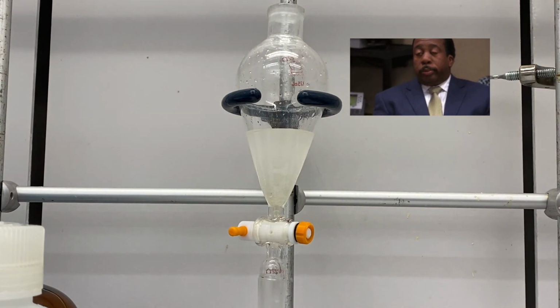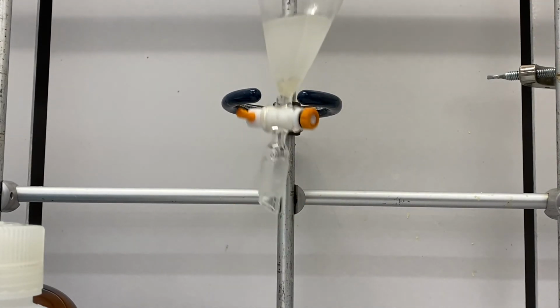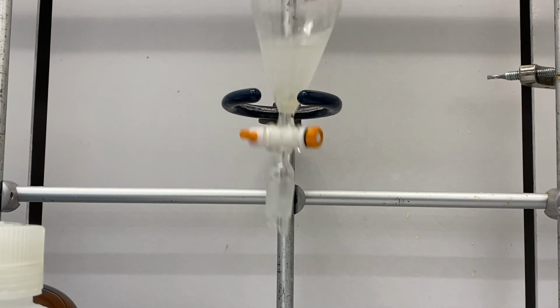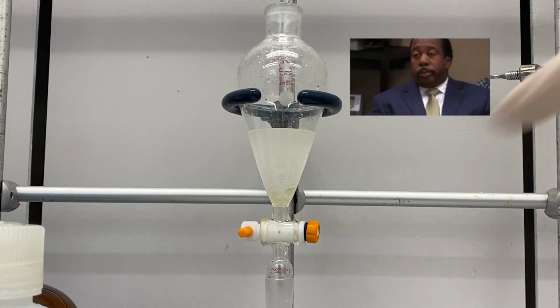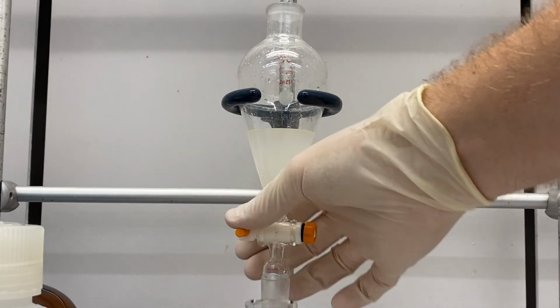So I keep swirling it to try to get anything that's stuck to the side to come together and form a liquid so it'll fall down to the bottom. Alright, so again, I kind of have two layers going here. You can see there's a layer of stuff down here at the bottom. We're going to drain that out.